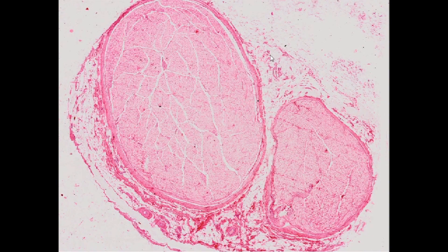The nerve trunk — H&E staining. The nerve trunk is a structure made up of nerve fibers in the peripheral nervous system. It is surrounded by fibrous connective tissue, the branches of which penetrate the nerve, separating both individual bundles of nerve fibers and individual fibers.